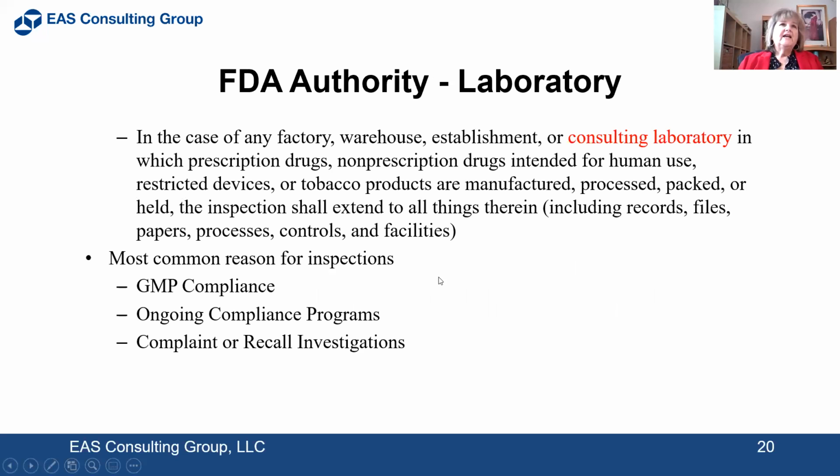So the FDA has authority over a laboratory to come and do an inspection. The most common reasons for inspections are lack of GMP compliance, ongoing compliance programs, or any complaint or recall investigation.